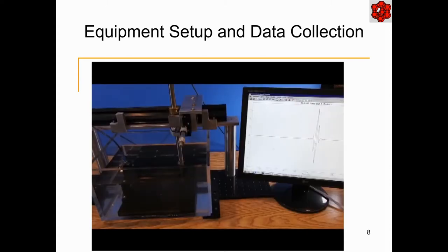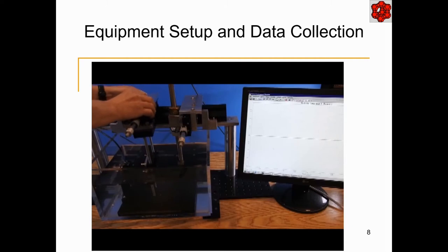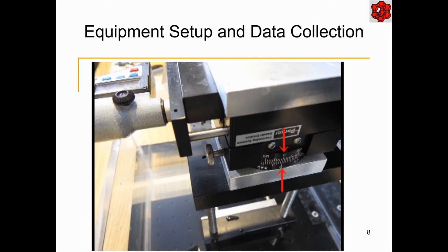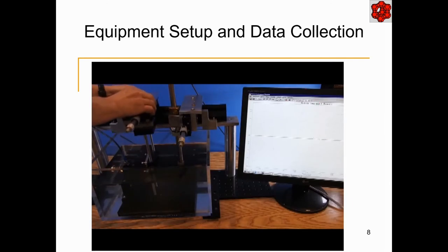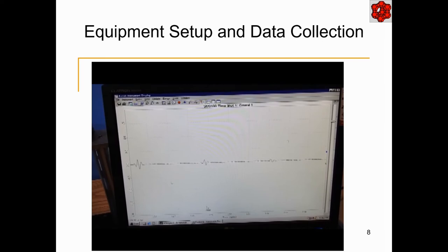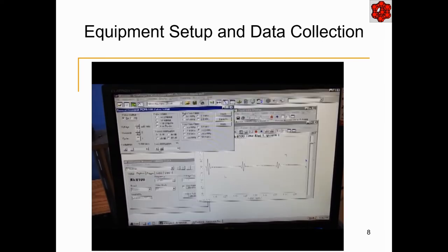A measurement with the sample is made next. We place the sample in the holder, ensuring it is approximately centered and squared to the mounting such that the major surface will be perpendicular to the beam when placed in the tank. Now we place the sample in the tank between the transmit and receive probes and adjust the goniometer to ensure that the sample is perpendicular to the beam. For most materials, we will usually observe that the time and the amplitude of the signal has changed. Moving the sample back and forth between the probes makes no difference to the signal or time or amplitude until you reach the near field of the transmitter.